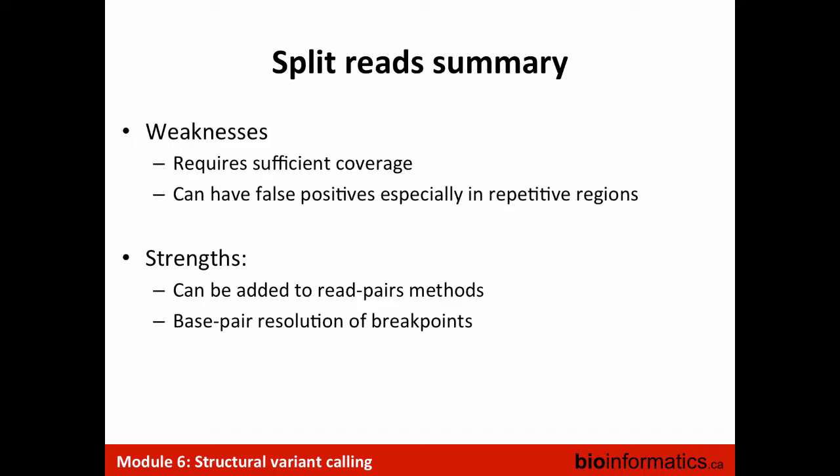So this does require sufficient coverage because you need, again, to have hopefully reads that cover the breakpoint. There's, again, this problem that in repetitive regions, you're going to have ambiguous mapping, and so this might get a little bit tricky.